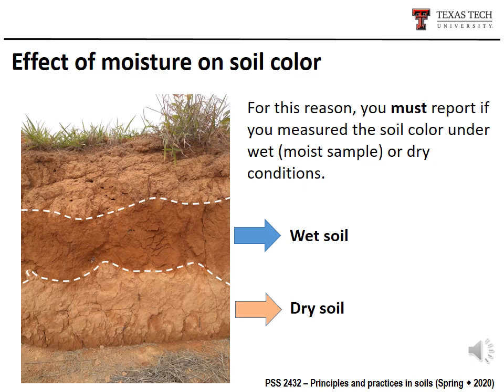For this reason, you must report if you measure the color under wet conditions or dry conditions. Okay?